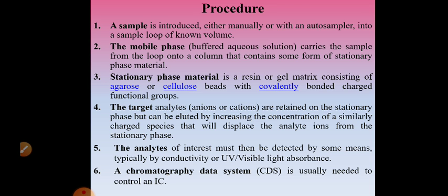Then very fine exchange particles may be present. These fines give unsatisfactory resolution and decrease the flow rate. So the finely powdered exchangers, which we do not want, are generally separated by suspending the exchanger in a large volume of water. When the large polymers have settled down, the slow sedimenting fine material can be decanted. So first you swell it, remove the metallic impurities by chelating with EDTA, and remove the fines by decanting them.